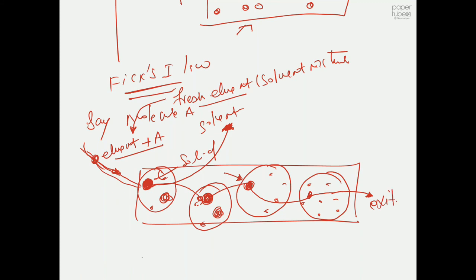So the time spent by the molecule A in this whole process defines the retention time. And say, if the adsorption is very weak, it can be easily knocked away by your solvent particles. So that's the main reason. In this case, we just assume your analyte A is weakly adsorbing onto your solid silica particles. So once it gets adsorbed, once it meets the next fresh solvent, it will be easily knocked away, and then it will be easily knocked away again. This is one reason. So the retention time is very low.